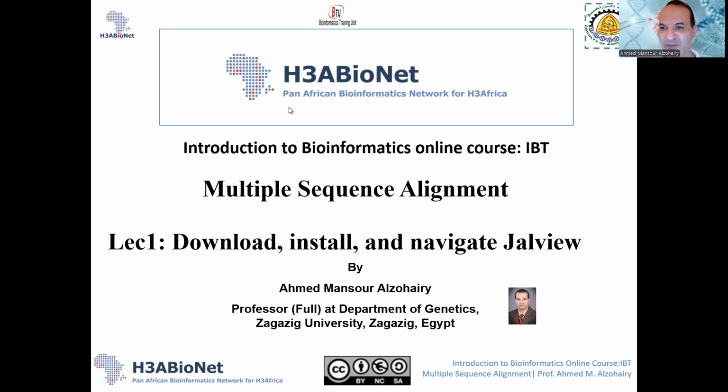Now we'll talk about very important software in multiple sequence alignment, and one of the best, I think, is Jalview. In this lecture, we will learn how to download, install, and navigate Jalview.